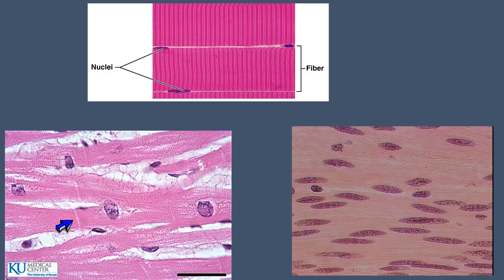So this just gives you a brief review of the four different types of tissue. As I said, histology is the study of tissues, so it takes quite a bit of practice to be able to look at a slide and be able to determine what type of tissue that is. So just start reviewing that so that you're familiar with the four different types, and then within each type, the different categories.